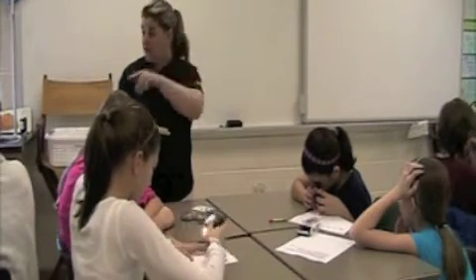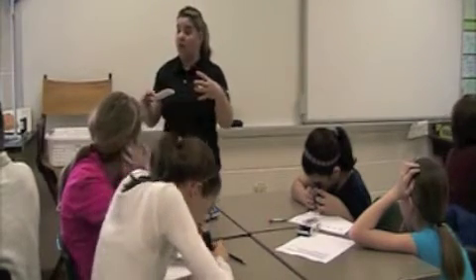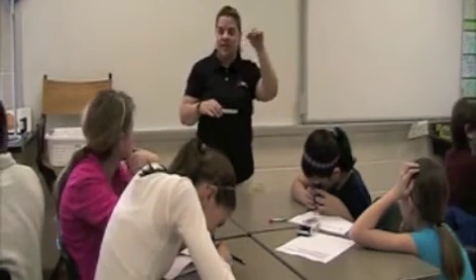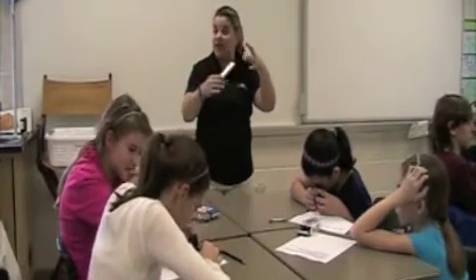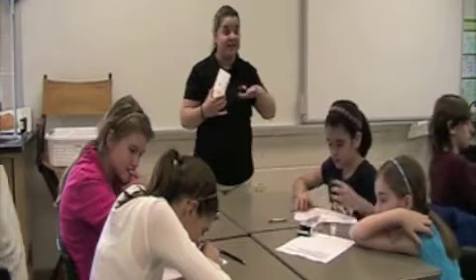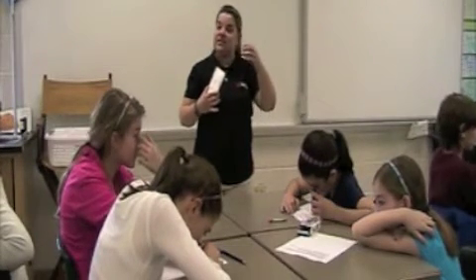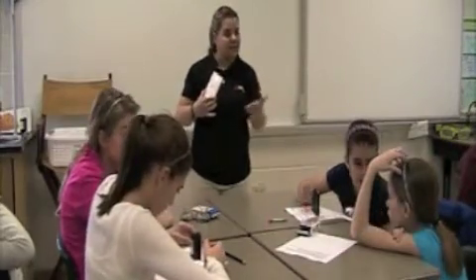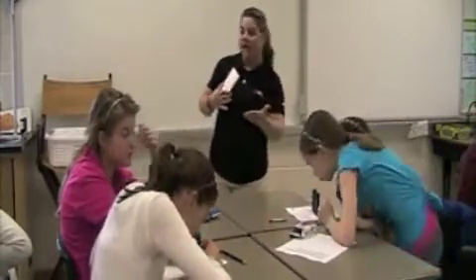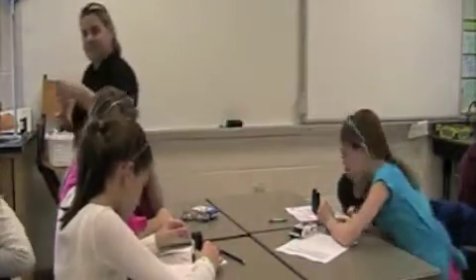Okay. What do you see? The letters are bigger. And sometimes you can actually see little dots that make up the letter, can't you? That's little ink dots that are laid down on the paper to make the print. Most often it's easiest to let the microscope rest on the object. That plastic clear bottom lets you do that, and then you can look down through it and do the zooming.